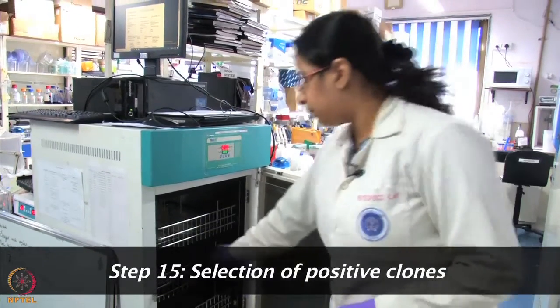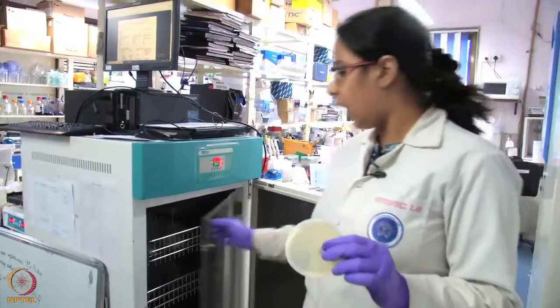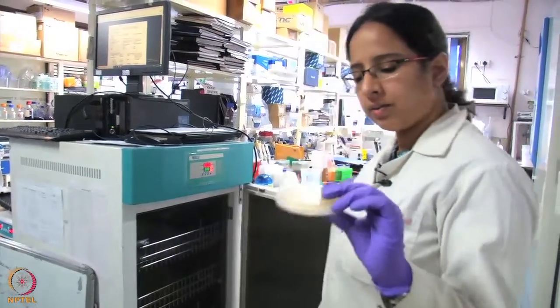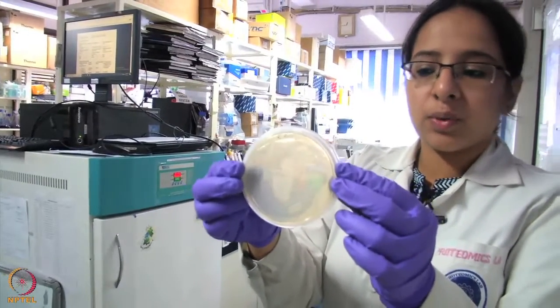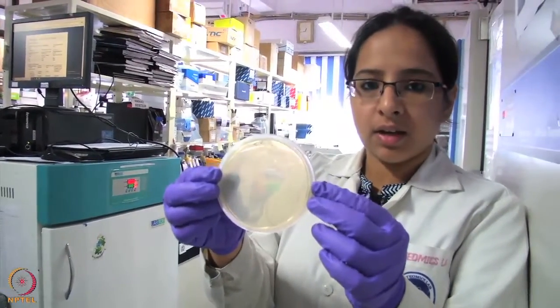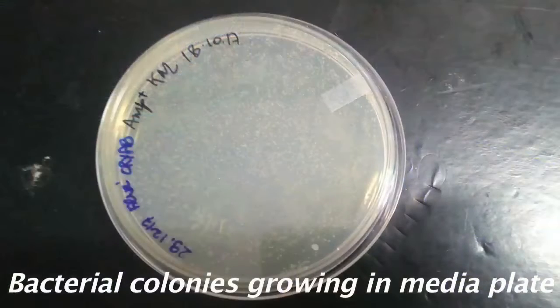I can show you another plate on which we already did the transformation yesterday, and how a transformed plate looks like. So this is a transformed plate which has a lot of colonies inside. So in this case the transformation efficiency has been very good. In some cases we do not get as many colonies.